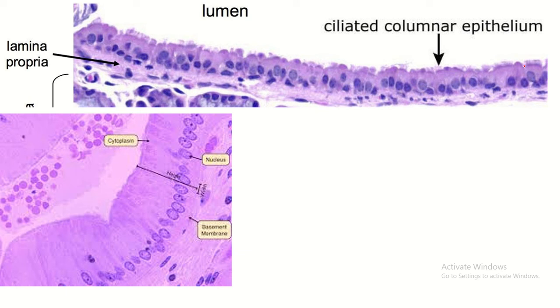The lining epithelium is pseudostratified ciliated columnar epithelium. If you look at the apical region, you can see irregularity and hair-like projections — these are the cilia.